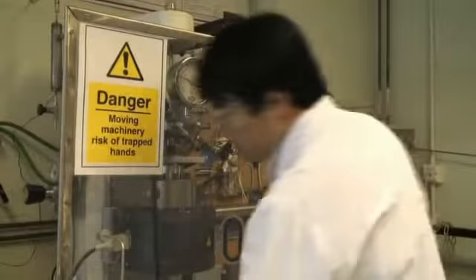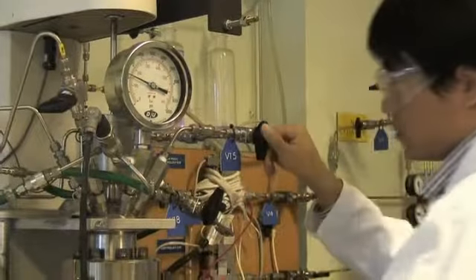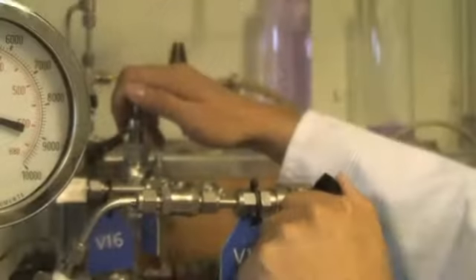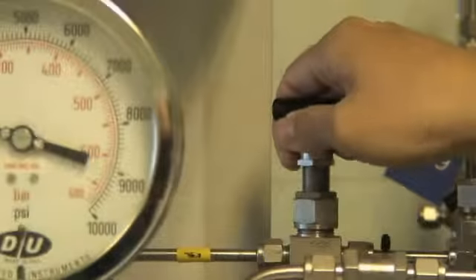This is our high-temperature, high-pressure carbonation reactors. We use it to simulate the real conditions for the geological storage. And the experiment I'm doing right now is brine, CO2, and rock carbonation studies.